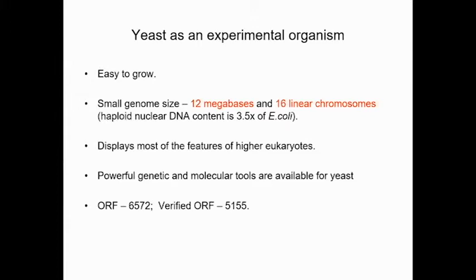All right, good. So for the rest of the week, I will do a demonstration of how to use the DNA software and how to design the gene knockout project. This will be useful for you later on, because each of you will have a specific project to perform gene cloning, and so you will need to learn how to do this.